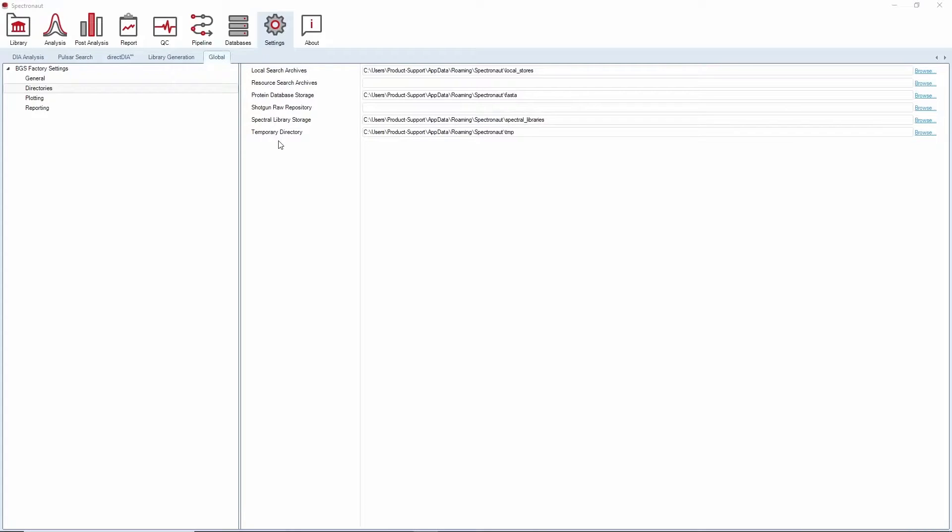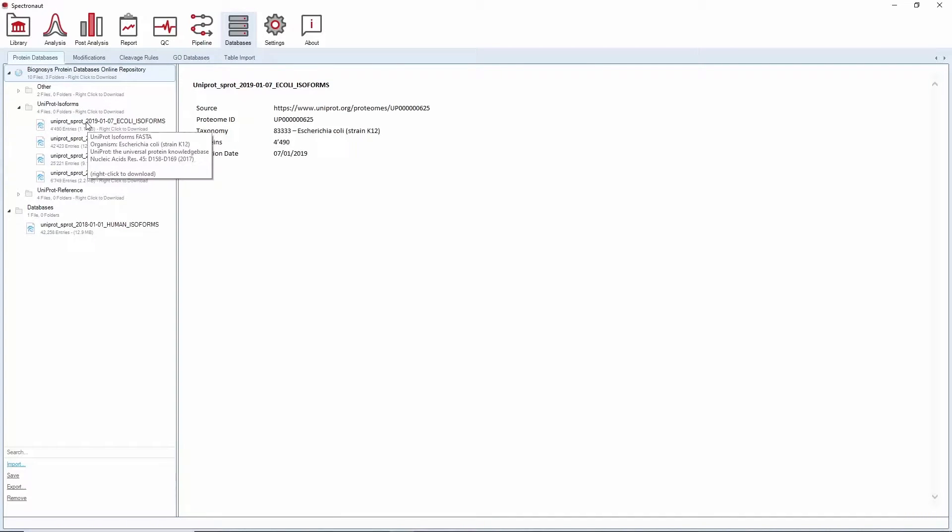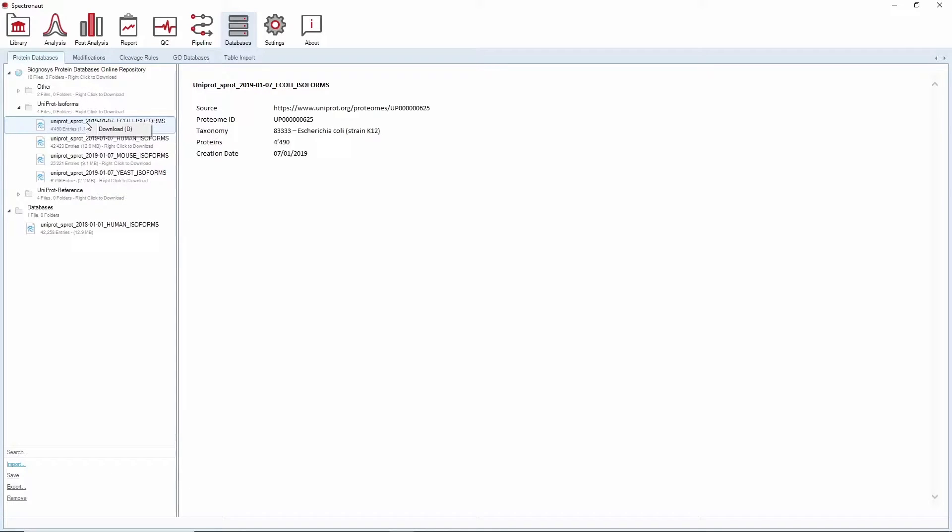Before starting your analysis, make sure that you have your resource files available. Under Databases, you can find our online repository. By simply right-clicking on a protein database, you can download the FASTA file and make it available in Spectronaut for all your analyses.